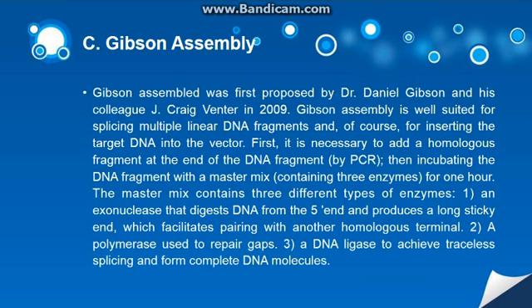Gibson assembly. Gibson assembly was first proposed by Dr. Daniel Gibson and his colleague J. Craig Venter in 2009. Gibson assembly is well suited for splicing multiple linear DNA fragments and, of course, for inserting the target DNA into the vector. First, it is necessary to add a homologous fragment at the end of the DNA fragment by PCR. Then the DNA fragments are incubated with a master mix containing 3 enzymes for 1 hour.